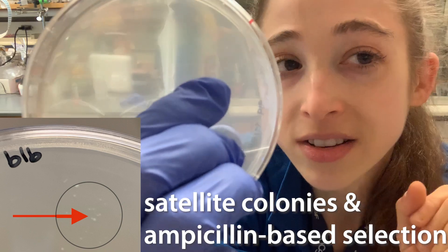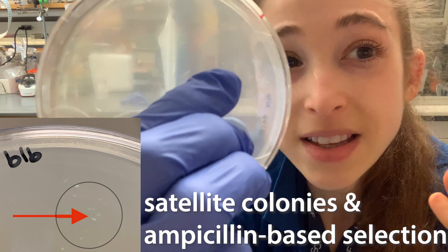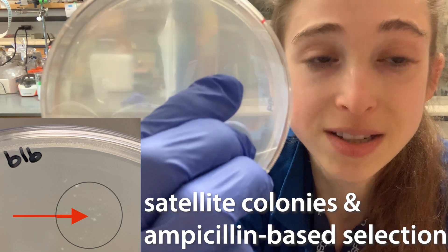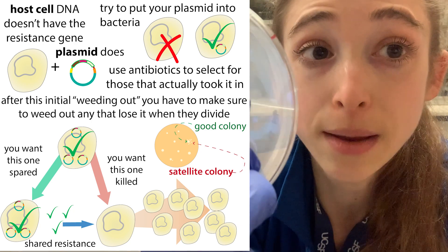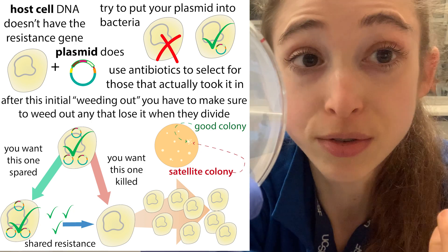Satellite colonies — those little tiny colonies that grow next to those bigger, more clumpy colonies — are kind of like bacterial freeloaders. They're able to grow along for the ride even though they don't have the plasmid inside, the plasmid that contains whatever genetic information we wanted them to have, such as the instructions for making a protein as well as an antibiotic resistance gene that we can use for selection.